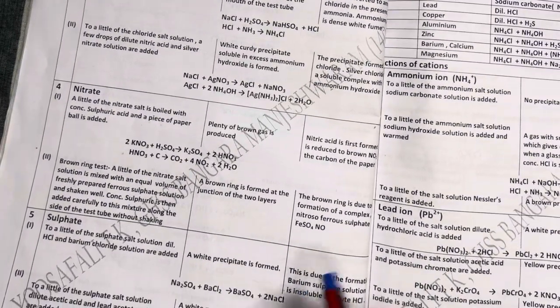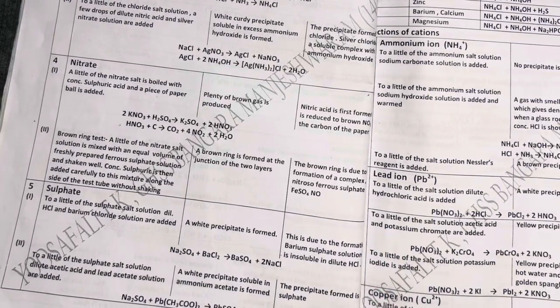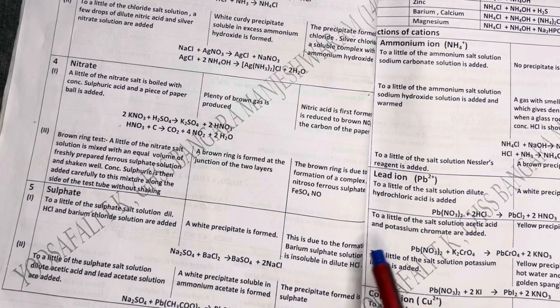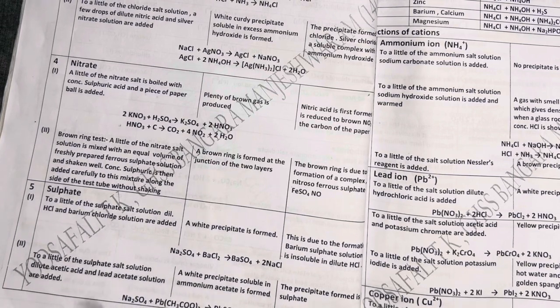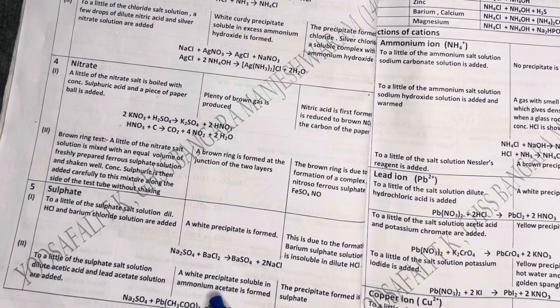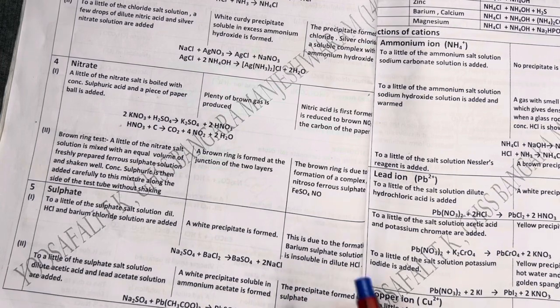Next confirmatory test is for the sulfate. To a little of the sulfate salt, you add dilute hydrochloric acid as well as barium chloride solution. If a white precipitate is formed, this is due to the formation of barium sulfate. And again, to a little of the sulfate salt solution, dilute acetic acid and lead acetate solution is added. If you get a white precipitate, then the precipitate formed is lead sulfate, hence the sulfate is confirmed. So these are the confirmatory tests.